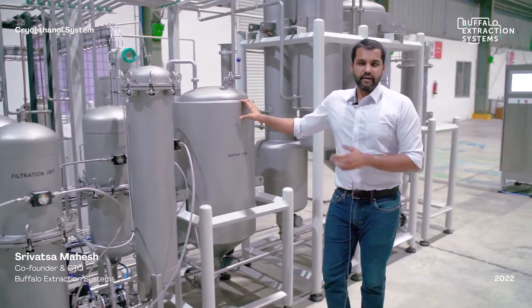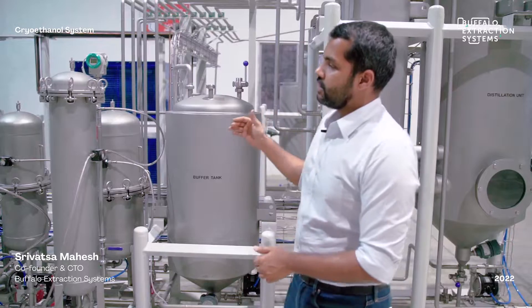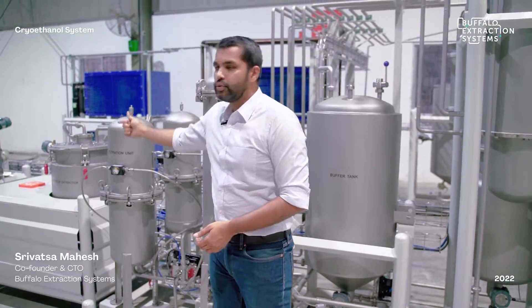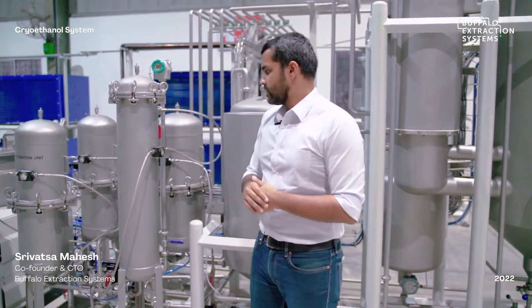A buffer tank is provided between the filtration skid and the solvent recovery system. In cases of low yield from the biomass where the ethanol is not saturated with oil, the filtered ethanol-oil mixture can be recirculated back into the storage chilling tank and reused multiple times — building concentration up to around 10% oil rather than just 1–2%, saving energy when yield is low.